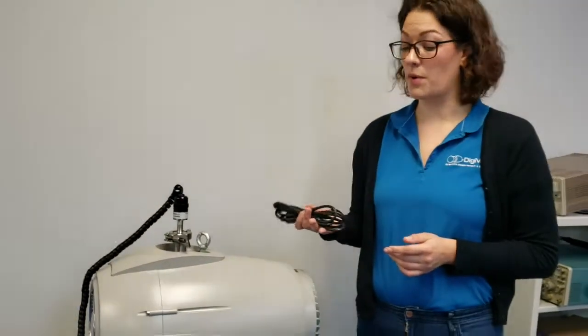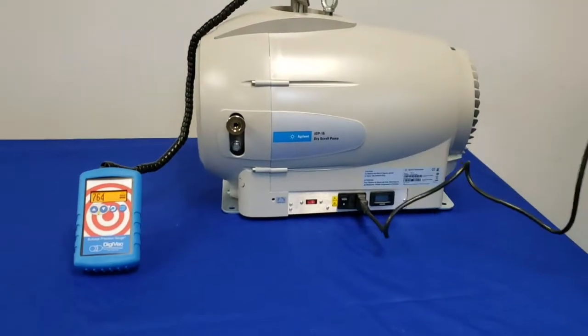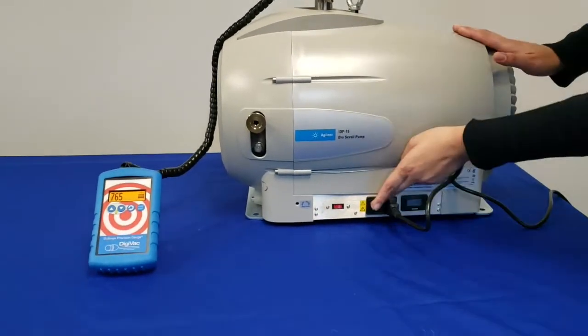If purchased directly from Digivac, this pump comes with a power cord. So we'll insert the cord, find our outlet, and flip the power switch.